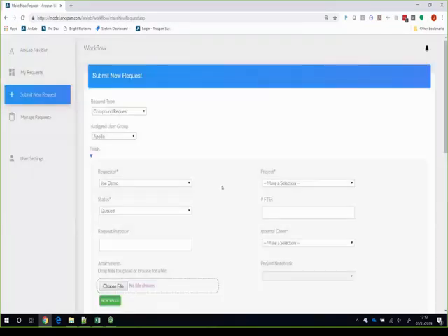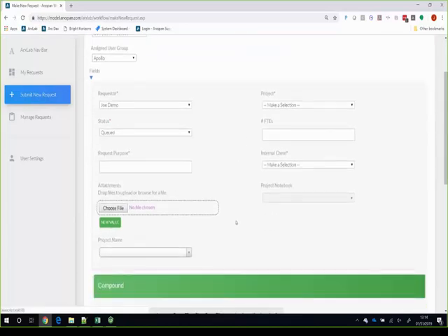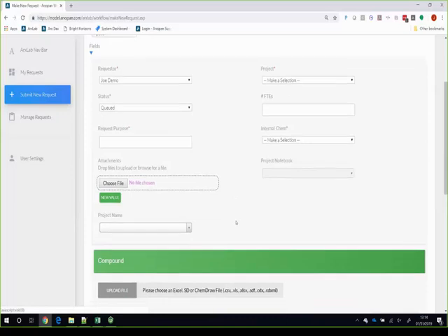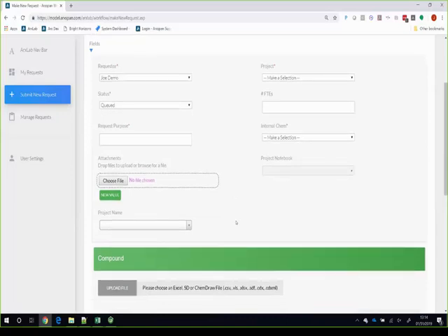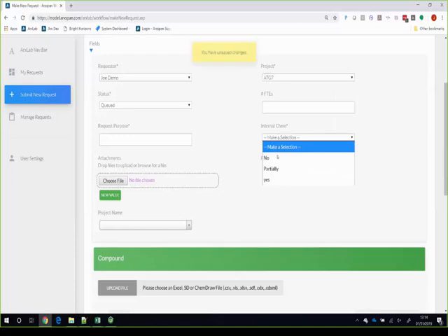And what you get here is a form that is completely configurable. So which fields are on the form and what their data types are, their status, whether they're required or optional, valid values, things like that are all configurable. We're just showing you something that we think is particularly relevant. So we can make a couple of data entries here just into the required fields.